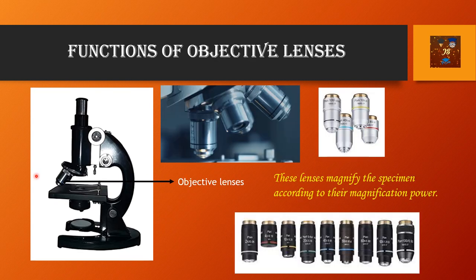Objective lenses: these are the objective lenses, attached with the revolving nosepiece. Usually there are three objective lenses — one is the low power objective lens, then the middle power objective lens, then the high power objective lens. These lenses magnify the specimen according to their magnification power. The low power objective lens is 10x and will magnify 10 times, then 40x, then 100x. All the powers are written on them.